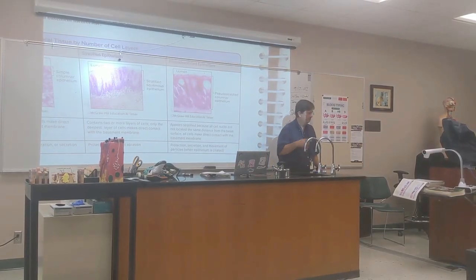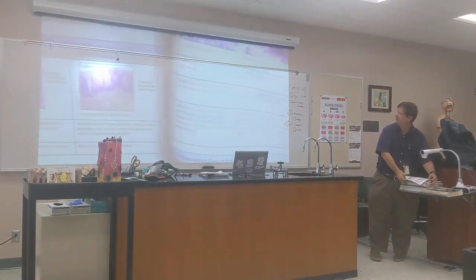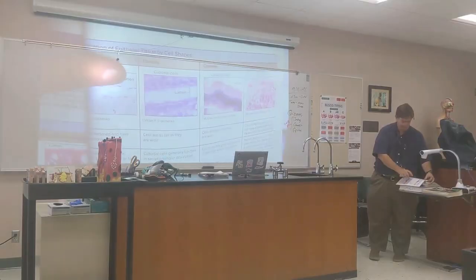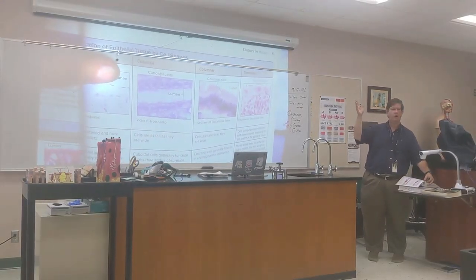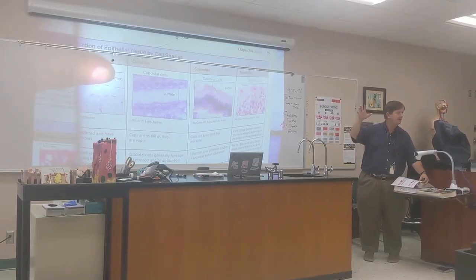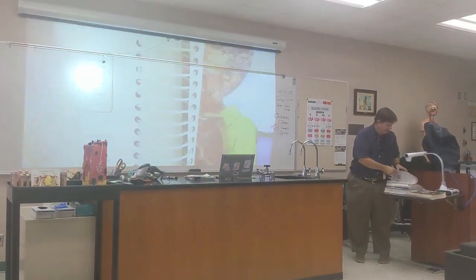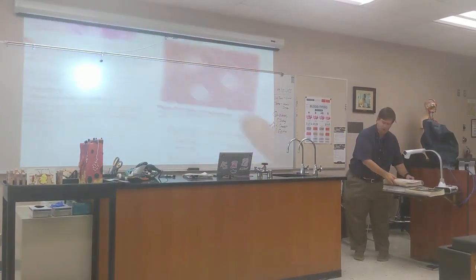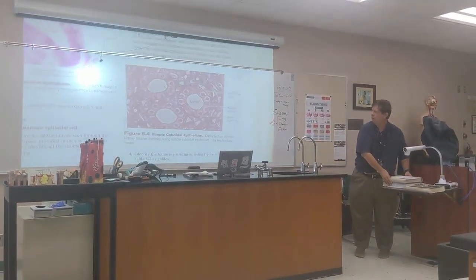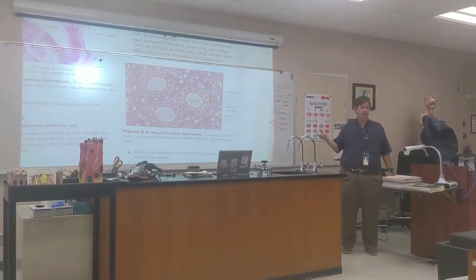Yeah, where was the location of the simple cuboidal? Oh, okay, thank you. People are pulling me forward and back. I was trying to say that, but I pointed out before, I said, oh, this is a nice picture right here. This is simple cuboidal. I said, that is a tubule cut longwise. Anybody remember me saying that? Anybody? Nobody. I promise I said it because I'm going to then show you simple cuboidal when you cut across the tube. The wall of the tube is made out of simple cuboidal. That's a kidney tubule. Good?